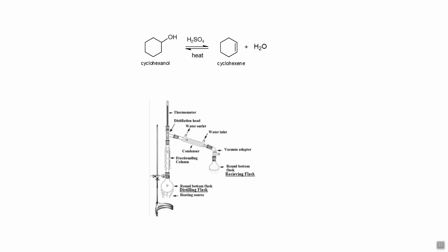If you have both, I would anticipate that most of you should only see the cyclohexene product here. You should not see a lot of cyclohexanol, just because we're doing this reaction in a distillation apparatus, which should prevent the product from ever being over here in the first place. Said another way, we should separate the product from the starting materials before we even start the liquid-liquid extraction.